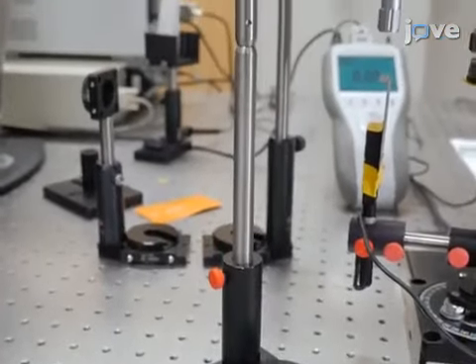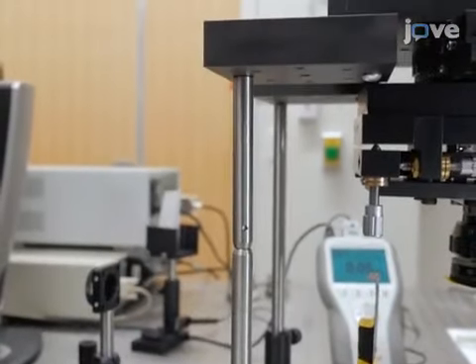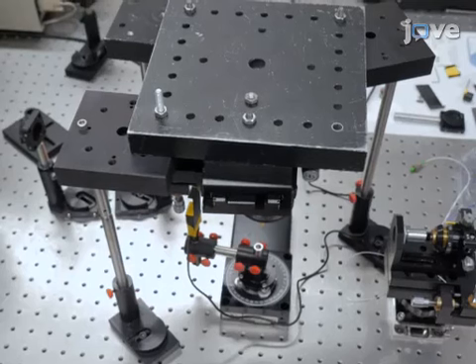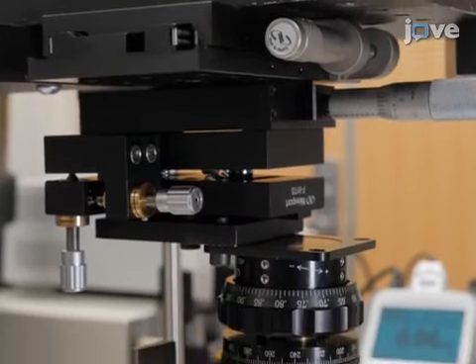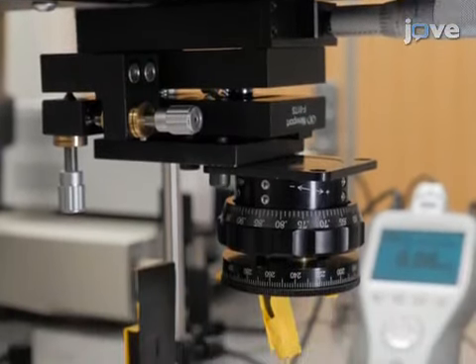Use 3 or 4 18-inch long, half-inch diameter cylindrical posts and post stands to support an 18-inch by 18-inch breadboard. The breadboard serves as the base for a 3-axis translation stage that is suspended below it.